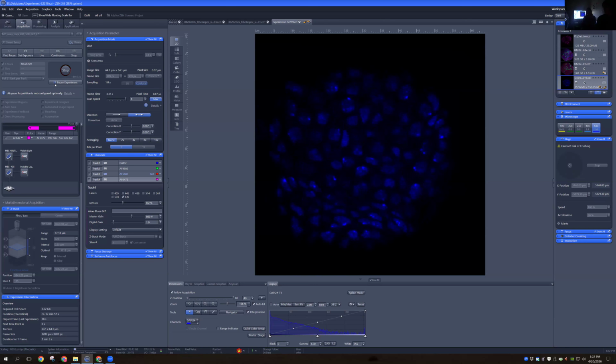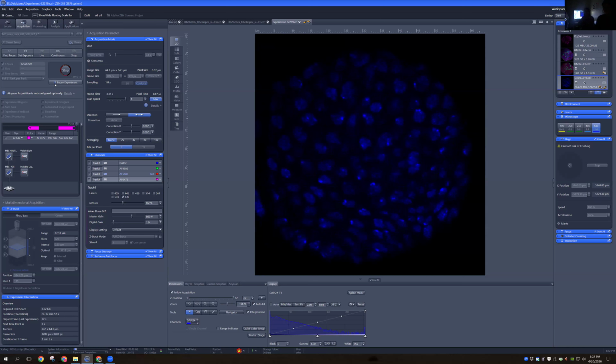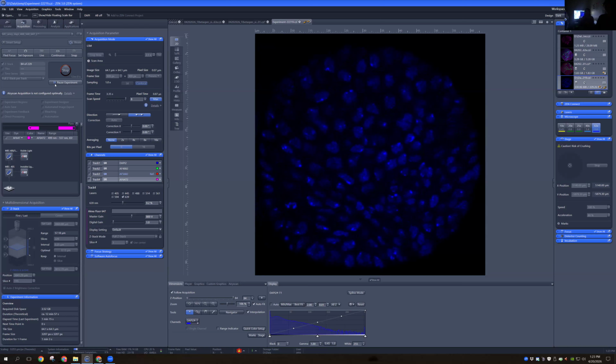That's such a good question. So I think it is a very long process to be able to use this piece of machinery and use it well. And this is also really important because this machine is shared by everyone in our lab, and it gets an immense amount of use. It's booked basically 9 to 5 every single day of the week, including most weekends. And so it's really important when you're using this machine that you are using it correctly, that you don't damage it, that you don't jeopardize anybody else's experiments. And it's also very expensive. And so I care a lot about making sure that I knew what I was doing before I started using it myself.